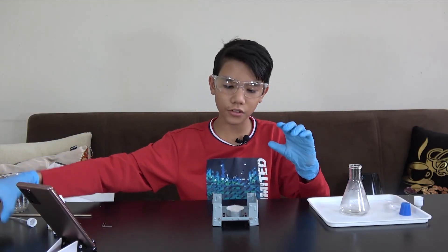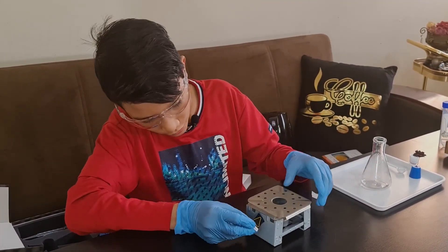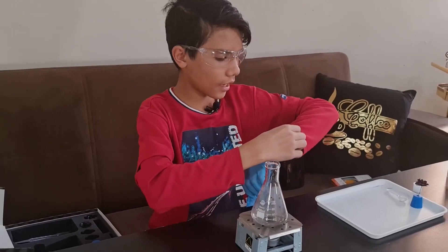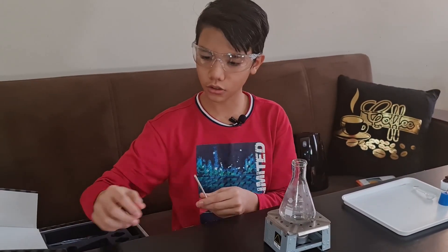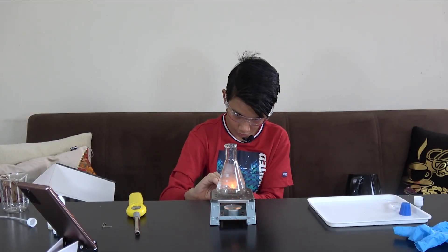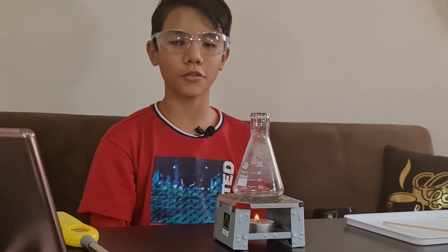I'll set the flame diffuser over the stove and apply the thermochromic sticker to the side of the stove so that we know when it's hot. Now I'll put our flask on top of the stove, take off our protective gloves, and light the candle using the wooden splint. Bismillah. We'll start the timer for three minutes and now we wait.